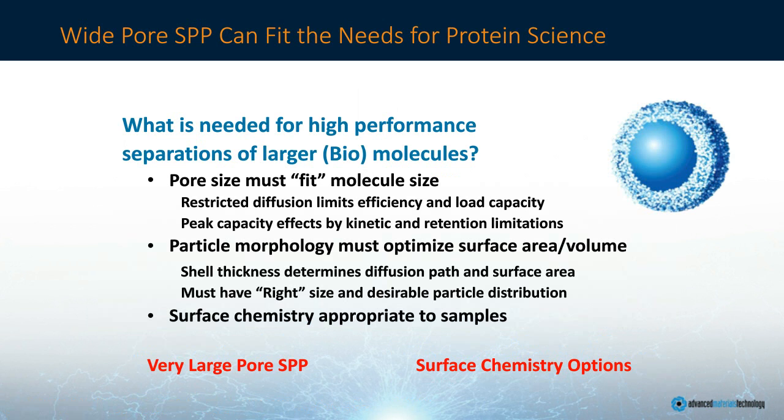So what are the needs for large biomolecule separations? Well, one, your pore size must fit the molecule size. Restricted diffusion limits the efficiency and the load capacity. Peak capacity effects by kinetic and retention limitations must be respected. Particle morphology must be optimized for surface area and volume.